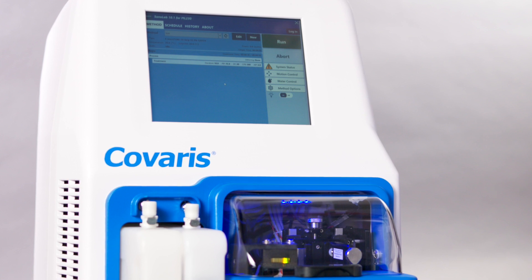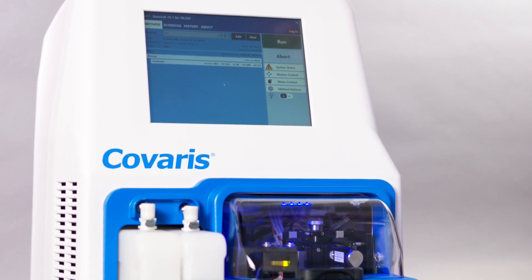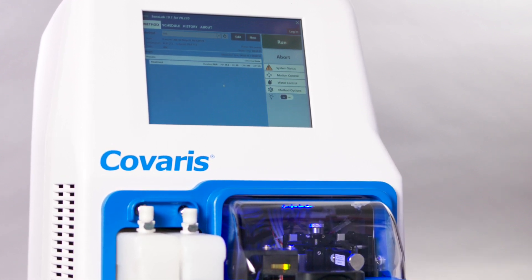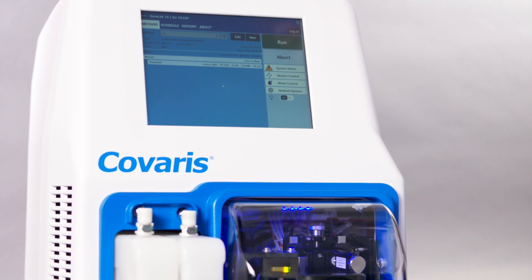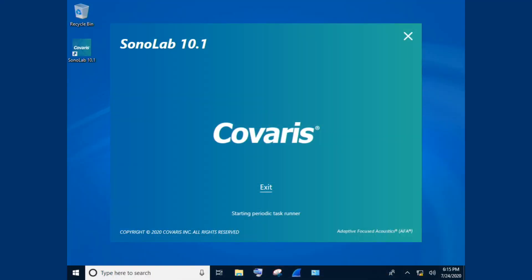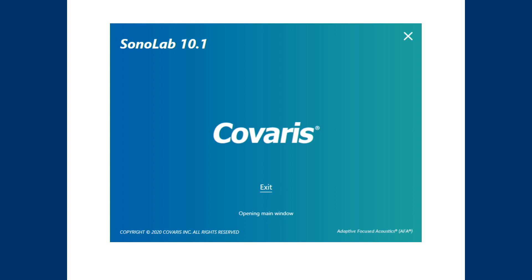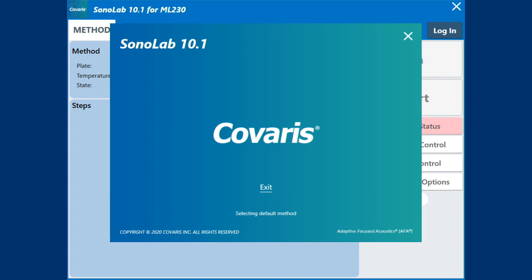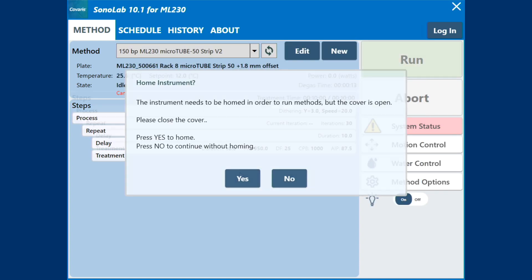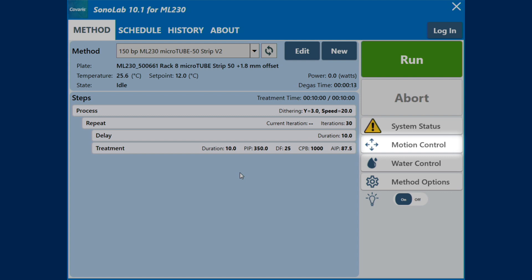To prepare for your first acoustic treatment run, the ML230 motion system must be initialized. The ML230 motion system normally initializes when Sonolab starts unless the user purposely skipped this step, in which case the motion system can be homed from the motion control pane.